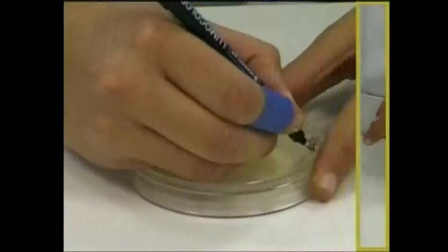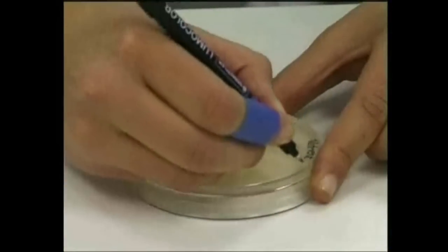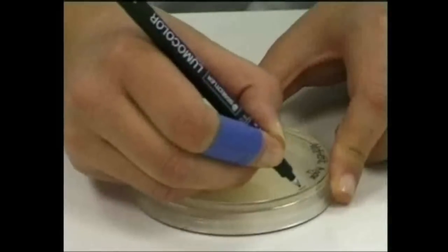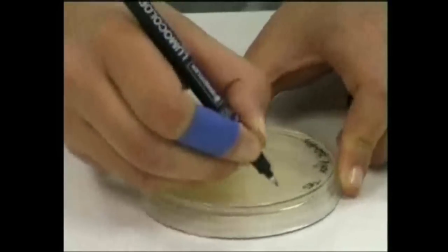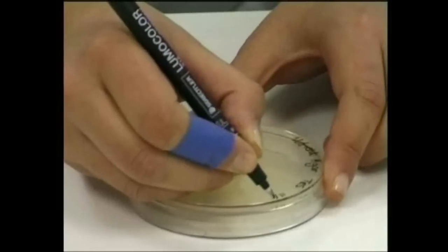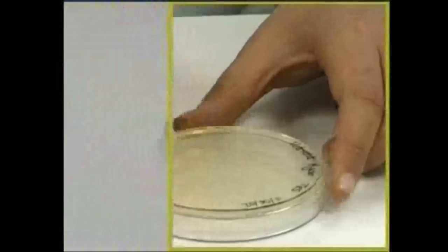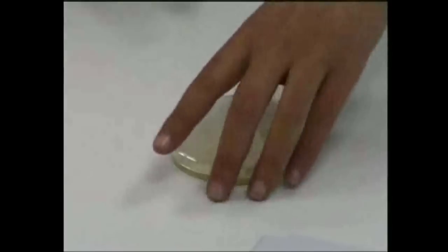All dishes should be labelled with your name, the date, and the name of the microorganism or the source of microorganisms. The base is labelled in preference to the lid because if the two halves become separated, the growth on the medium can still be identified.